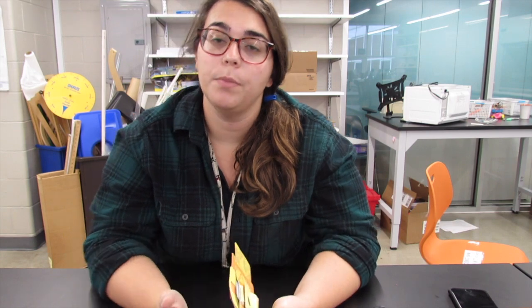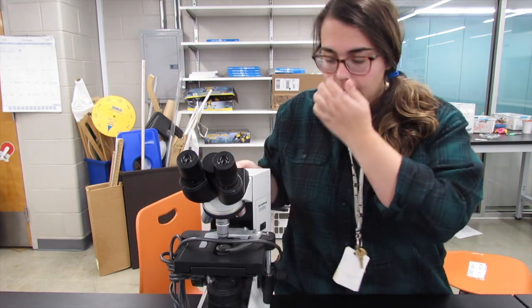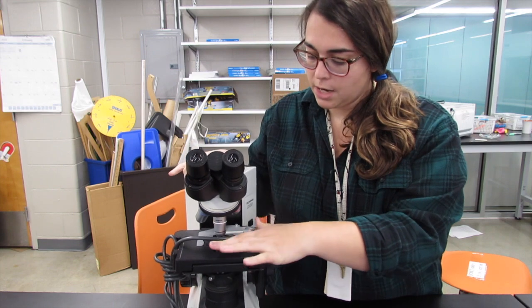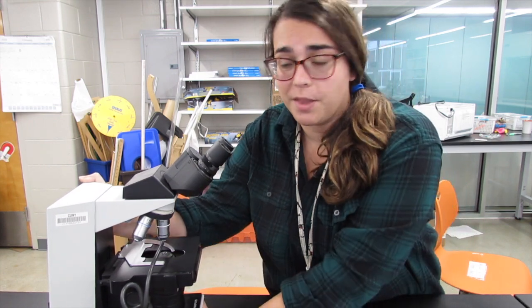So this is the Foldscope. This year, in addition to using traditional microscopes, we thought it might be fun to change it up and use these as well. Every year in science class up until now, we've used a microscope that looks like this. This is a really nice one — these are actually donated to us, so thank you. You look through the eyepiece here, you put your specimen on the stage here, and you focus it using the adjustment knobs here. This microscope is an excellent tool to look at things close up. You might look at a plant sample and look at the cells, or even look at your own cells.